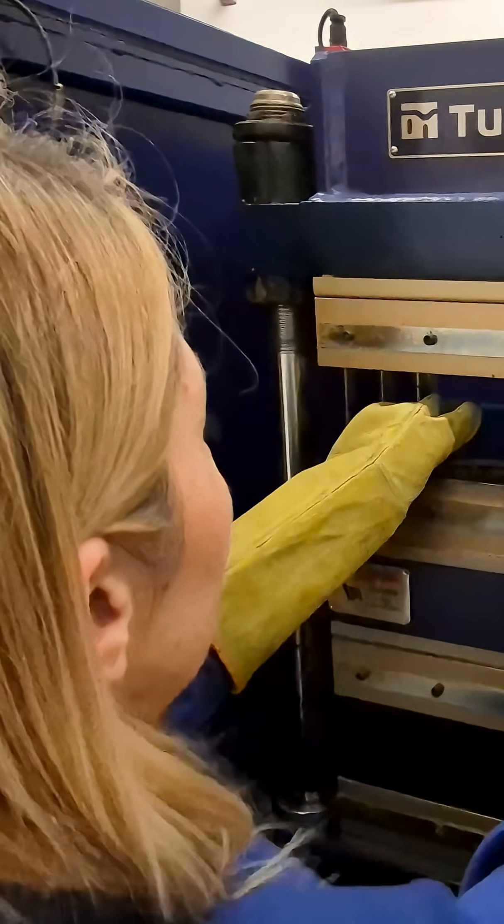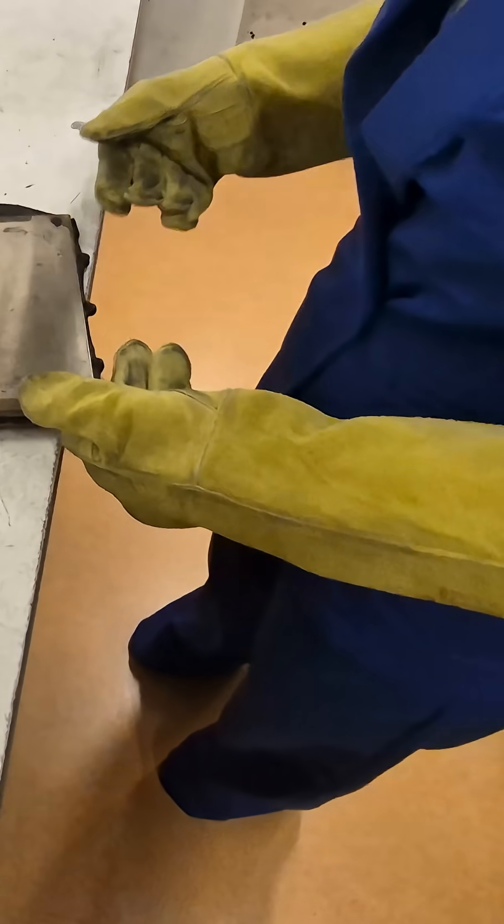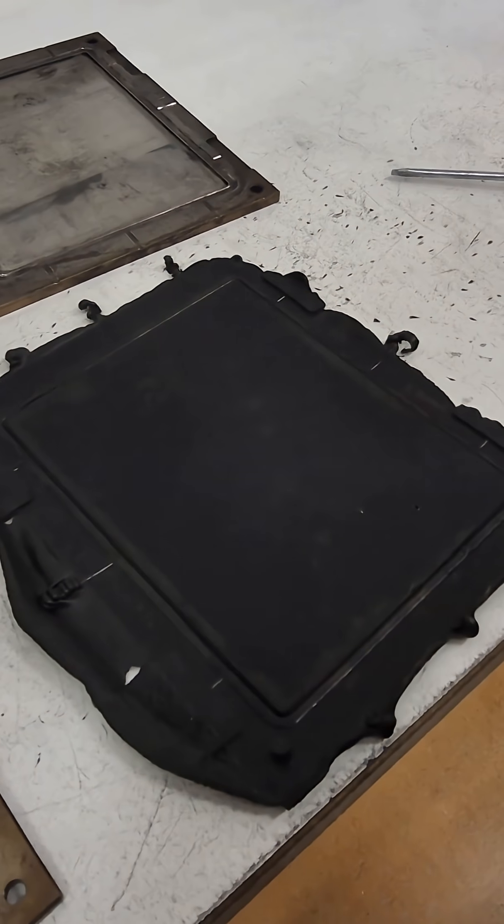A good rule of thumb is to take the T90 from the MDR and add about 20 to 30% to account for heat transfer into the bulk of the part. So if your MDR says T90 is 8 minutes, you would probably start with 10 minutes in the press. But this correction isn't universal — it depends on the thickness of the part, the press efficiency, and even the specific rubber formulation.